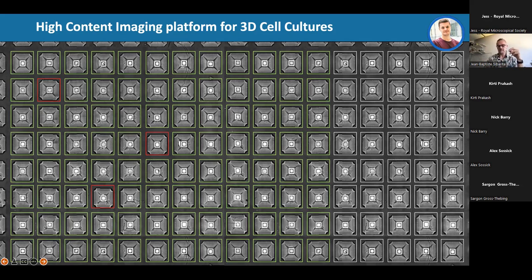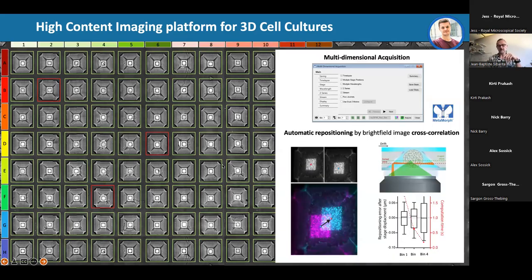You can filter out, you can automatically collect data. Again, another limit is drift, you remember. Maybe not a drift, but now we're talking about days of acquisition. High content screening, which means following in live the evolution of organoids.